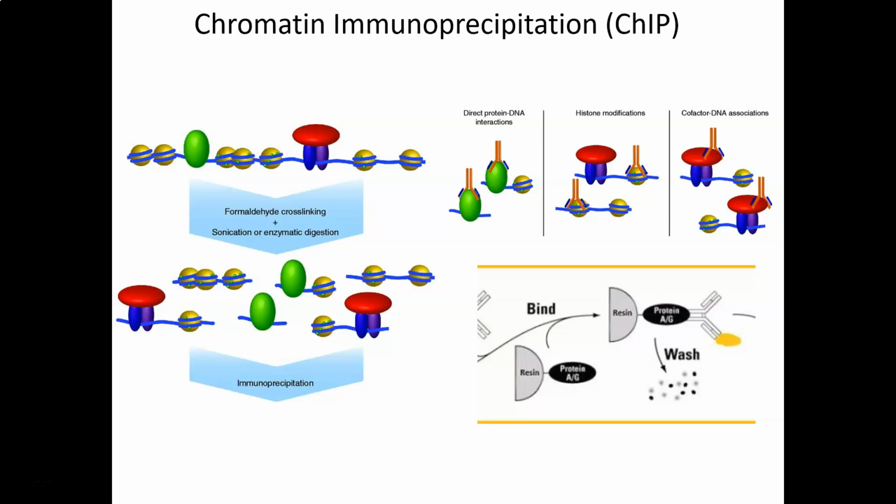And because it's this granular sand, these resin molecules are relatively heavy in the grand scheme of everything else we're working with, and they will come down to the bottom of a test tube quite readily. In fact, if we leave the test tube on the bench for half an hour, this will come down in just 30 minutes, which shows just how heavy it is. But if we spin it down in a microfuge, it'll come down in a few seconds.